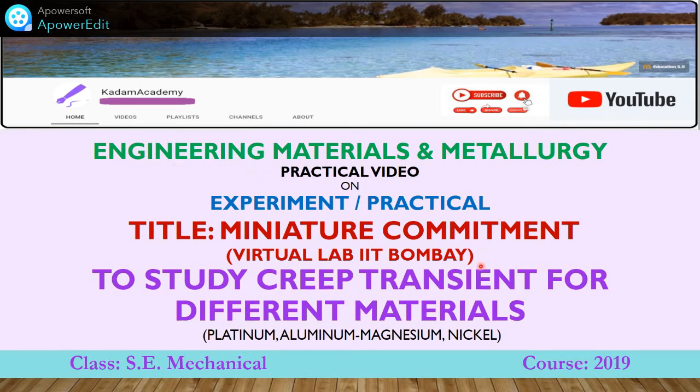Experiment practical title: Miniature Commitment. Aim: to study creep transient for different materials.